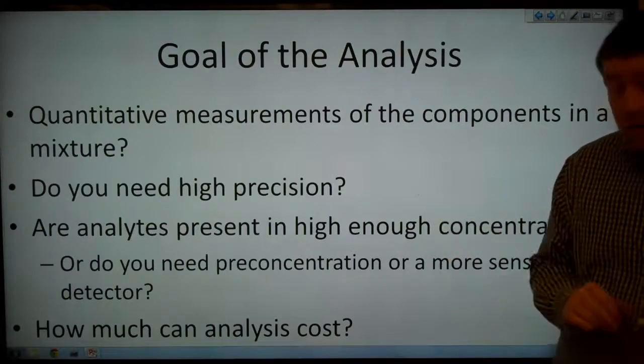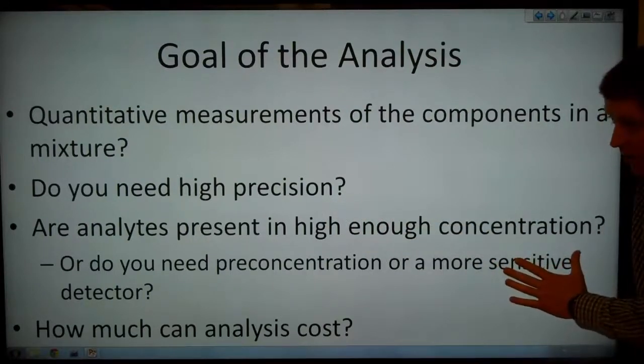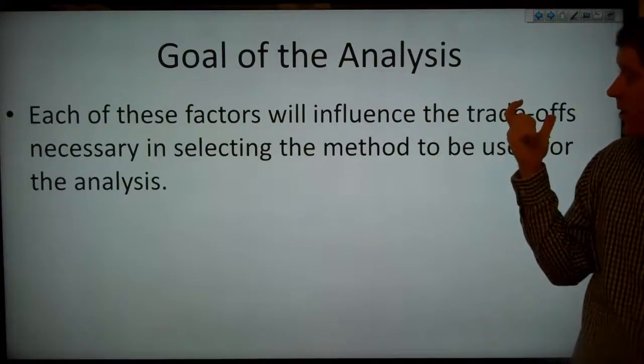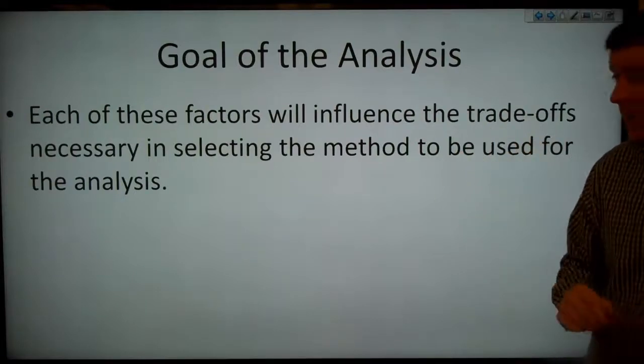Do you need high precision? Are the analytes present in high enough concentration? Or do you need pre-concentration or a more sensitive detector? How much can the analysis cost? So each of these factors will influence the trade-offs necessary in selecting the method to be used for the analysis.